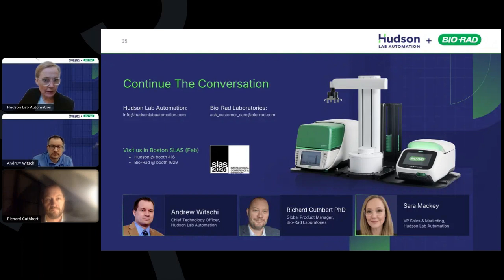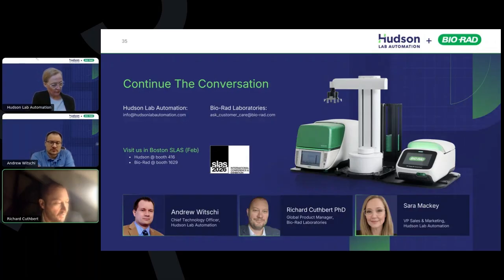Thank you. Next one's for you, Richard. Does Bio-Rad offer pre-mixed antibody cocktails for flow, and how do those fit into automated workflows? Yeah, so antibody cocktails are quite useful for things like screening assays, because it means that you can make up your assay once and just reuse the cocktail. So it really fits in well when you've got lots and lots of samples.